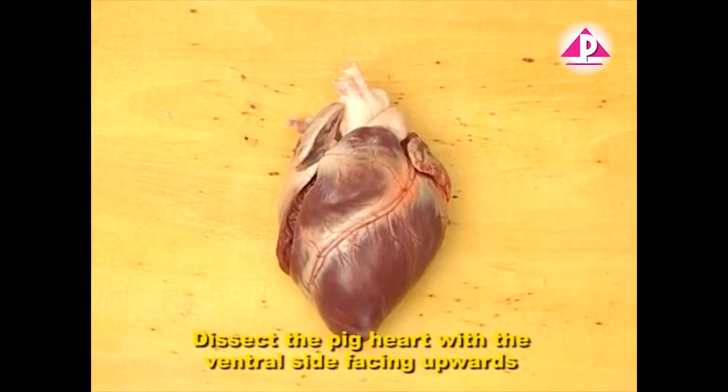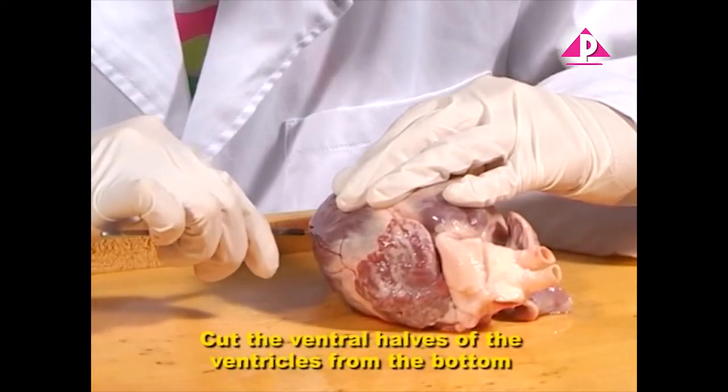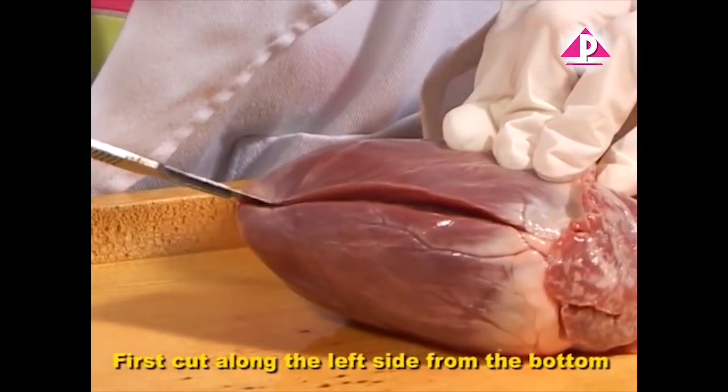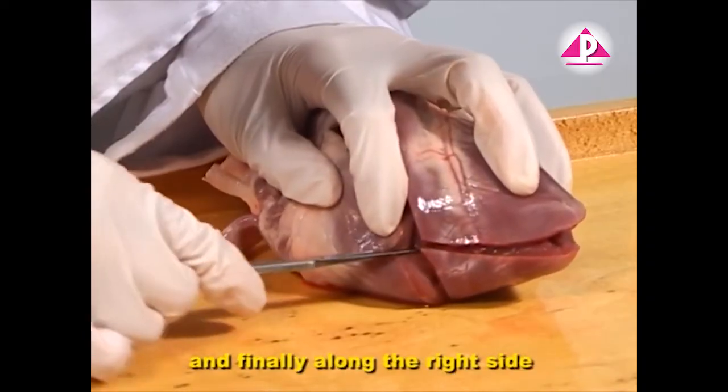Dissect the pig heart with the ventral side facing upwards. Cut the ventral halves of the ventricles from the bottom. First, cut along the left side from the bottom, and finally along the right side.